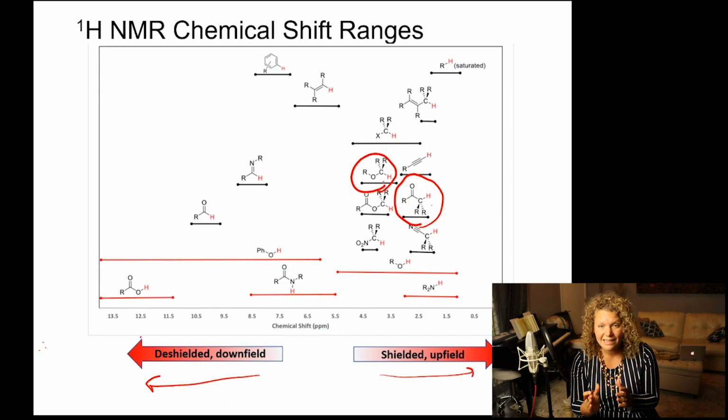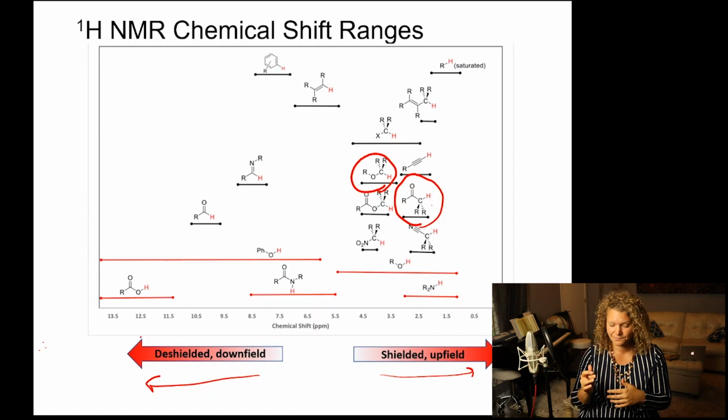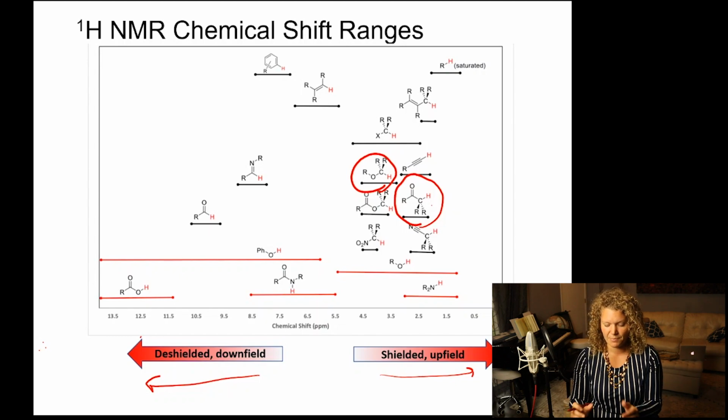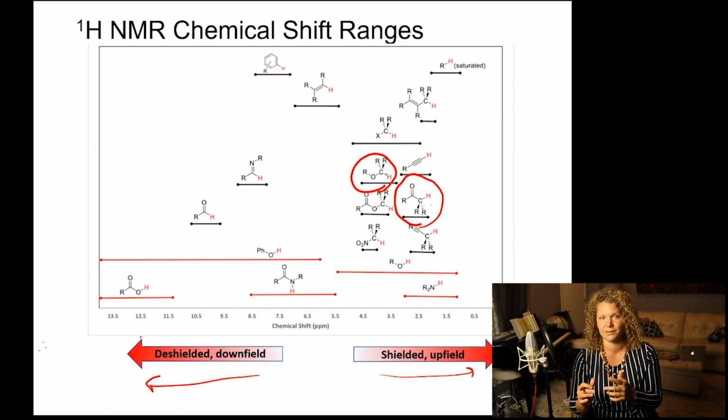As you can see, our OMe group is going to be shifted more downfield than our methyl group that's bound to a carbonyl. Based on this appendix, it's clear the range for the methyl group bound to an oxygen. Those hydrogens are going to be shifted to higher ppm, or downfield.